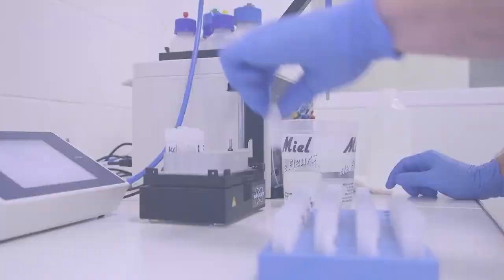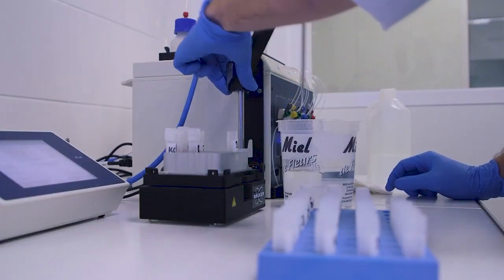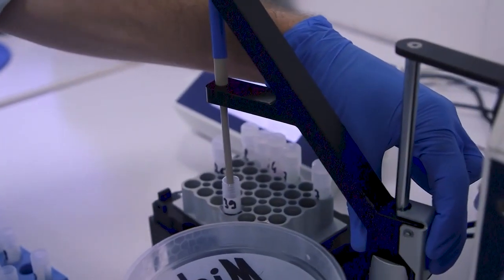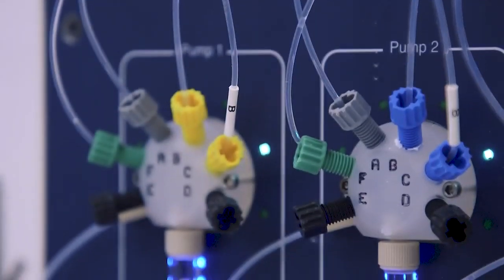The BT-pH unit measures the pH of each sample and adds acid or base as required to adjust them to one preset value without manual interaction.